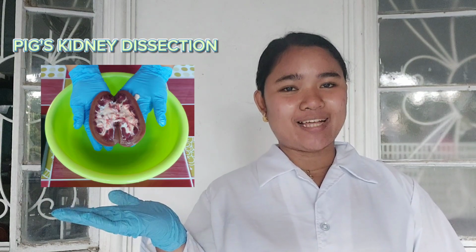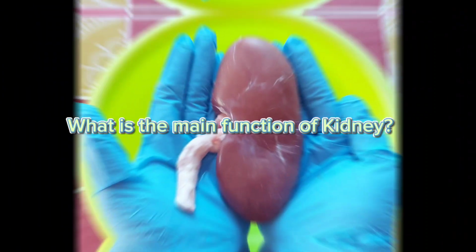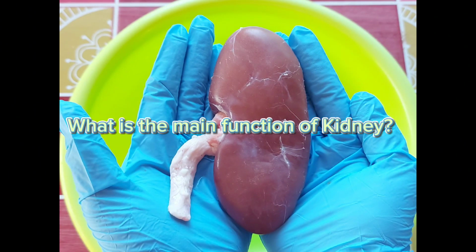So for today's activity, I am going to perform pig's kidney dissection. So let's start! So first, what is the main function of kidney?